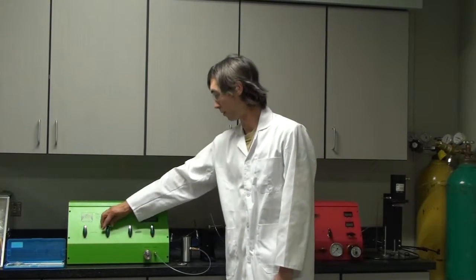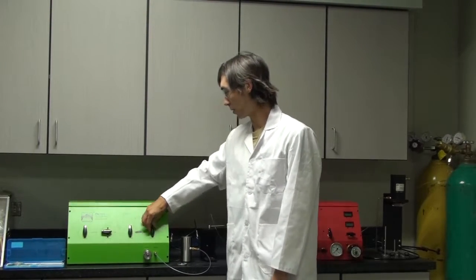Pressurize and depressurize the core holder by closing gas supply valve and then opening the supply gas valve to vent and to core. Now begin the experiment by closing the gas supply valve and open two vent and two core valves. Read and record the digital pressure value as 0 pressure.